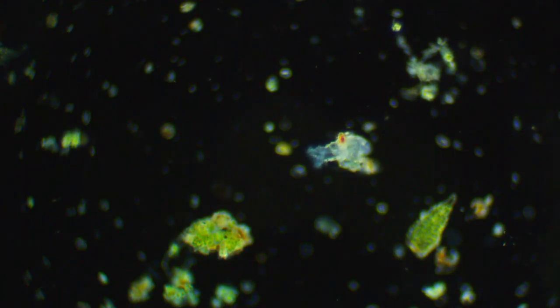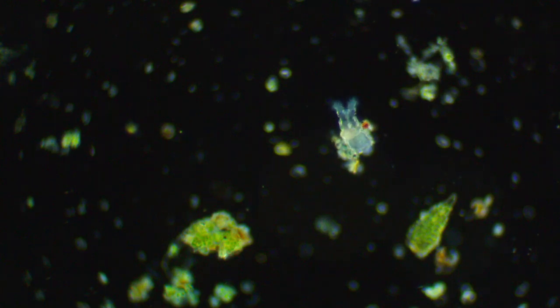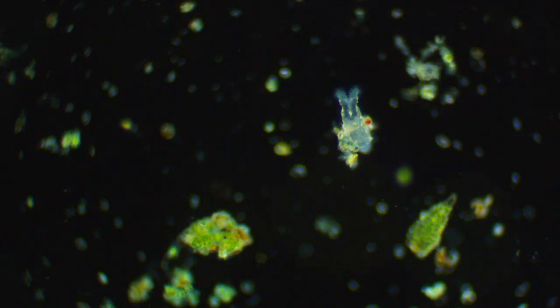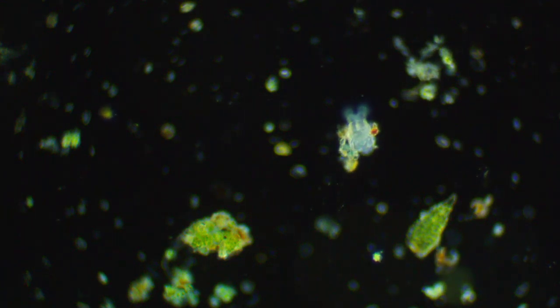Now, of course, we're back to a depression slide with several drops of water. So I'm only on the second objective. I can't really go to the third one. This looks like a slightly different species of rotifer to me. It's got a different head shape. Pretty interesting.